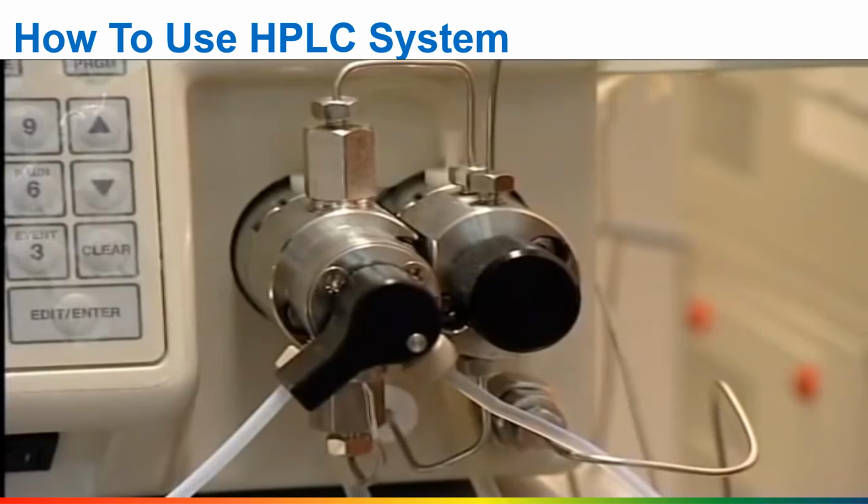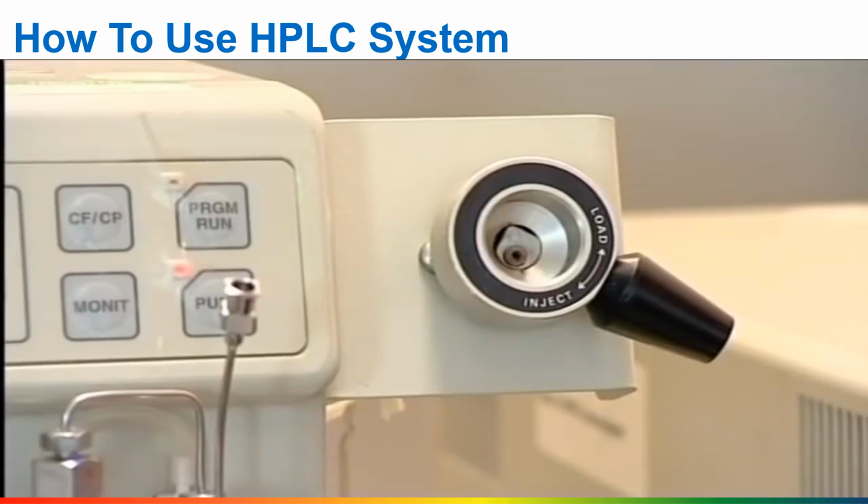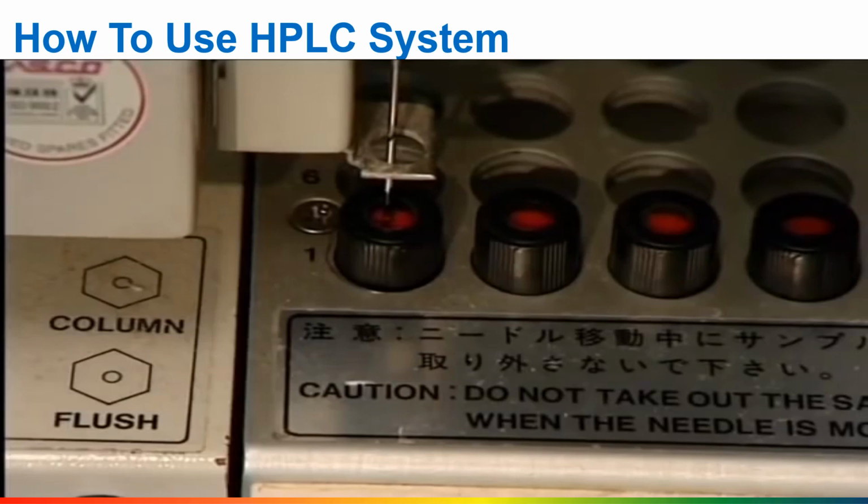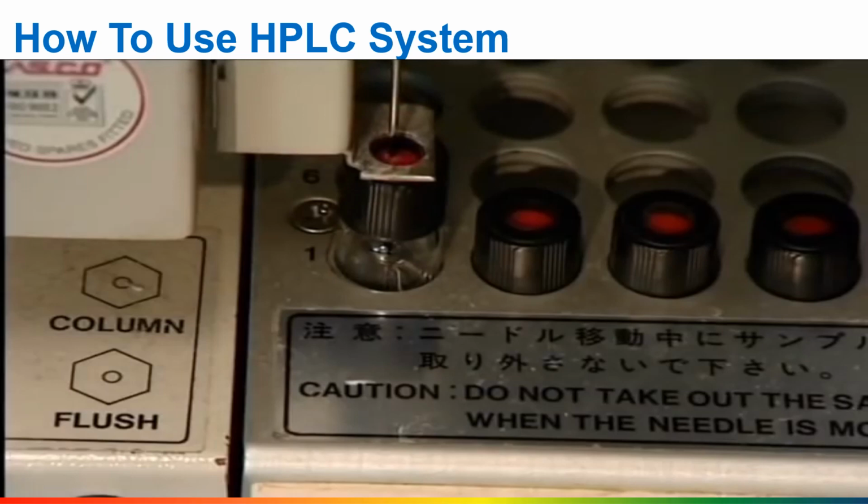If a single sample is to be run, it is injected into the solvent stream here, in the injection port, via a hypodermic syringe. Alternatively, several samples can be run in succession by loading them into this auto sampler, which will run them in order without any human intervention.